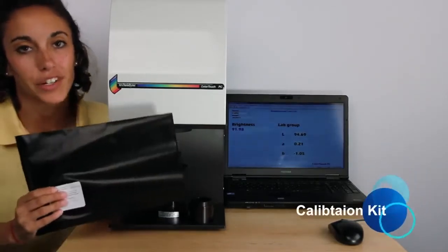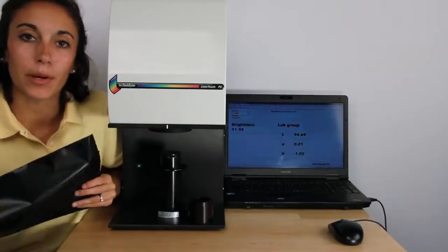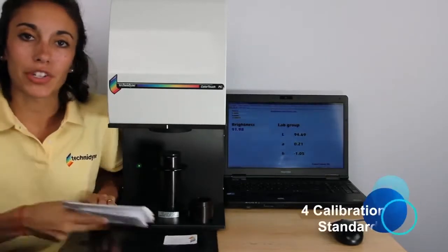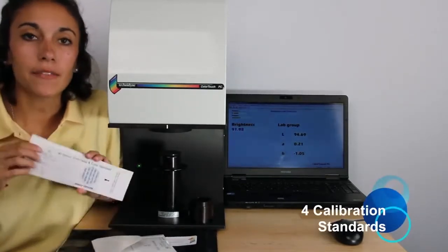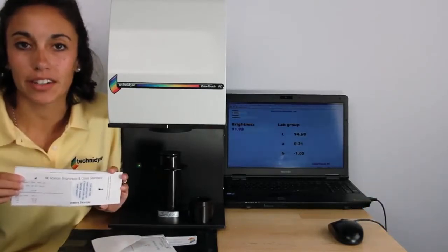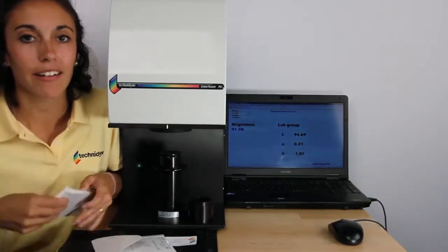The first thing that you should have is your calibration kit. Inside your calibration kit, you'll find four calibration standards. The 90 and the fluorescent standard are your primary standards, and 60 and 70 are used to verify measurement linearity.